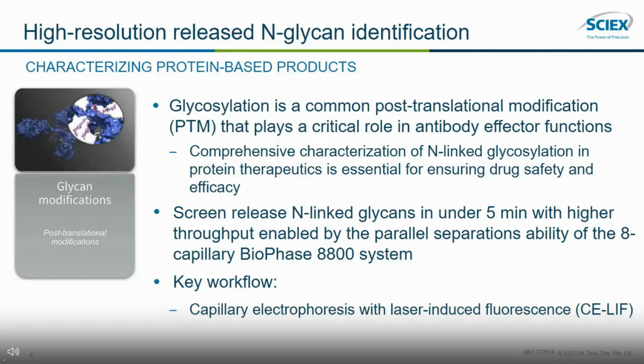After the N-glycans are enzymatically released, they are labeled with a fluorescent dye, separated by CE, and then detected with our LIF detector. This glycoform profiling of therapeutic proteins provides valuable data towards understanding the activity and efficacy of these molecules. These N-linked glycans strongly influence the circulation half-life, immunogenicity, and receptor binding activity, as well as play an important role in physiochemical and thermal stability in proteins of our therapeutics of interest.